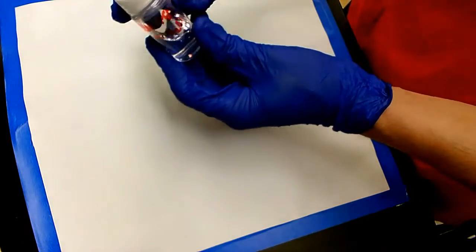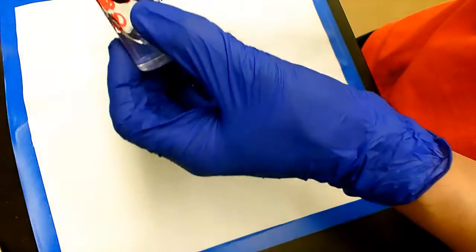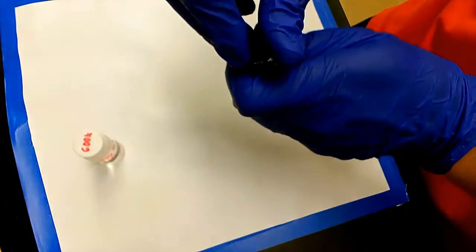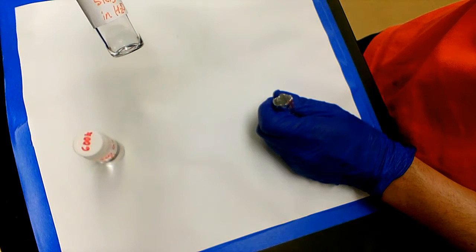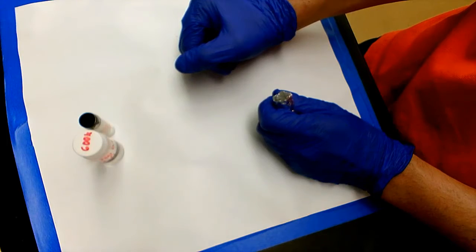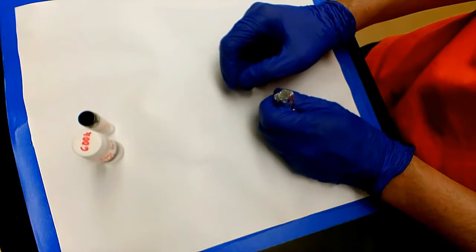So you're going to need your polymer stock solution in this vial. This is one of the solutions I prepared a long time ago. It's a 0.2 weight percent 600K PEO solution in water. As you can see, the polymer has been fully dissolved. I will also need a dye stock solution. This is a 200 nanomolar SRB dye in water as well. So what I'm going to do now is mix the two together to get 1 nanomolar SRB dye in 600K PEO solution.